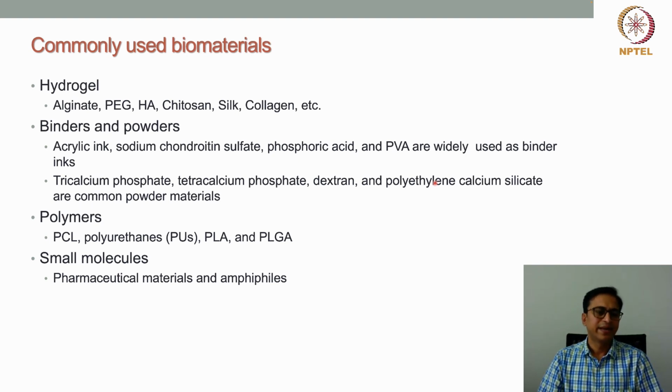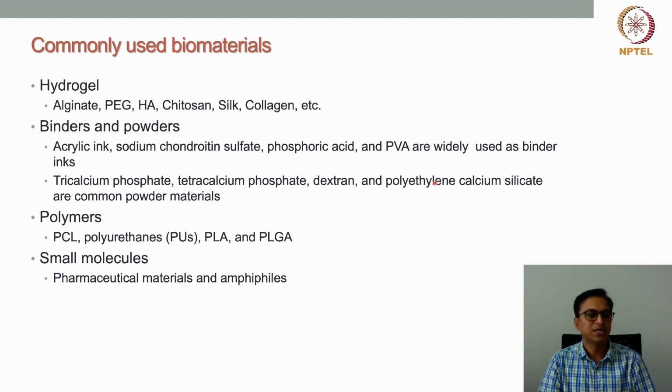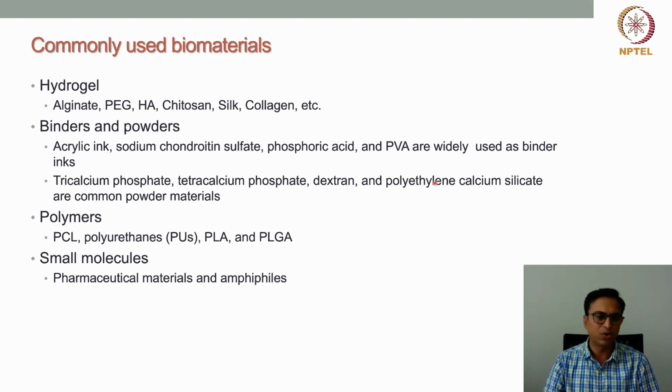Similarly, in inkjet printing, various polymers are also used. I have written here only four examples: PCL, polycaprolactone, polyurethanes, polylactic acid, polylactic-co-glycolic acid. Similarly, there are various types of polymers, either in aqueous solvent or in organic solvent. All these different types of polymers are mostly used.